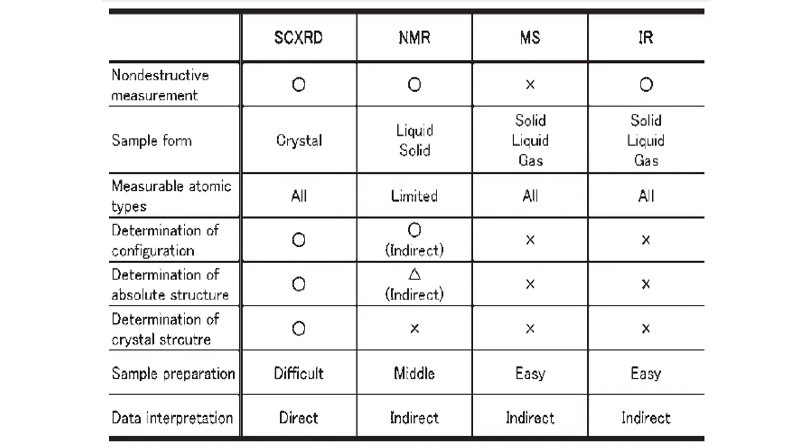This is the comparison between single crystal X-ray diffraction, NMR, which is nuclear magnetic resonance, MS, mass spectrometry, and IR, infrared spectroscopy.